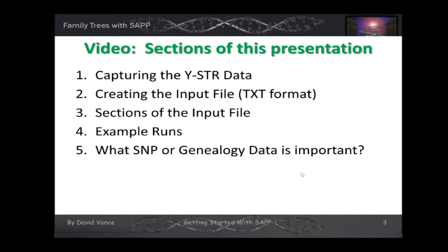But to get started, in this video, we'll talk about 5 different things. One is capturing the Y-STR data. First of all, where do you get it from? How do you put it into the format that the tool needs?